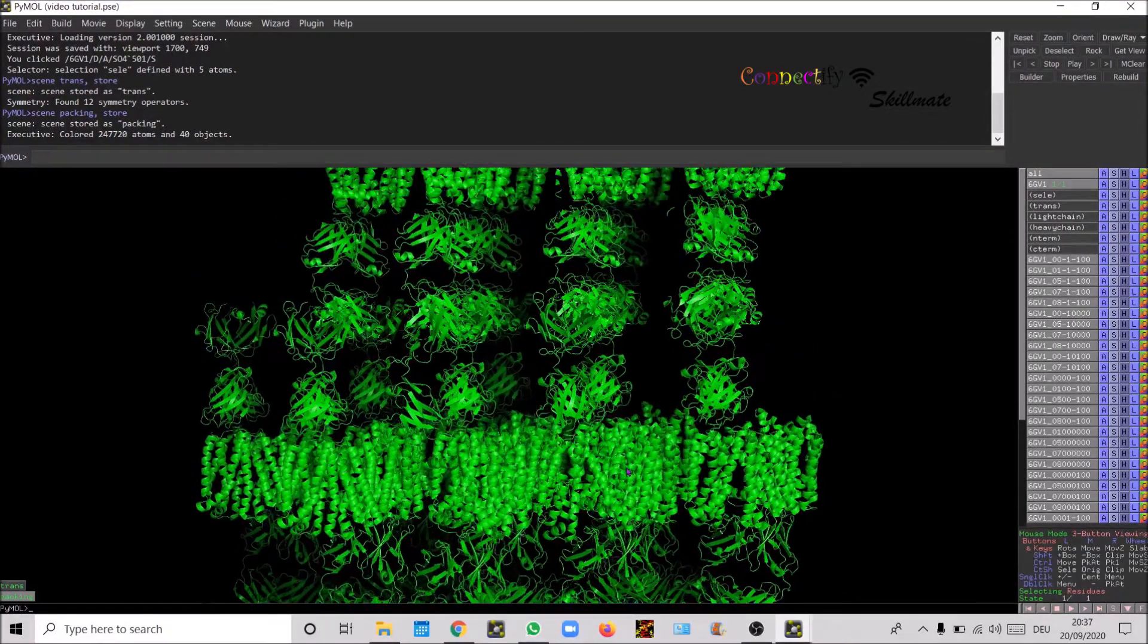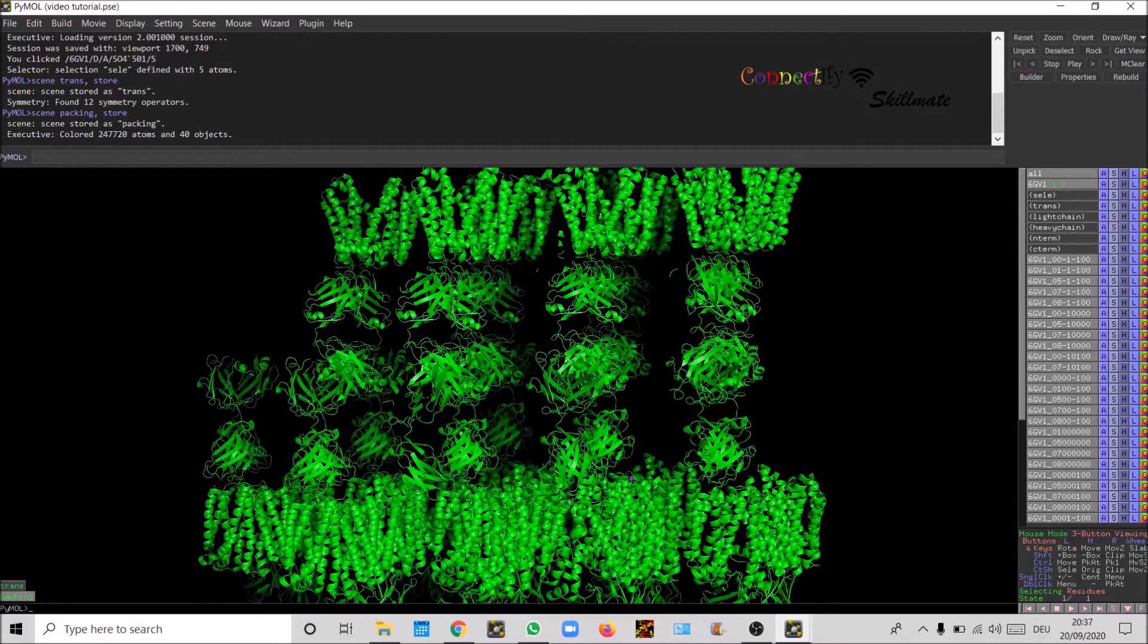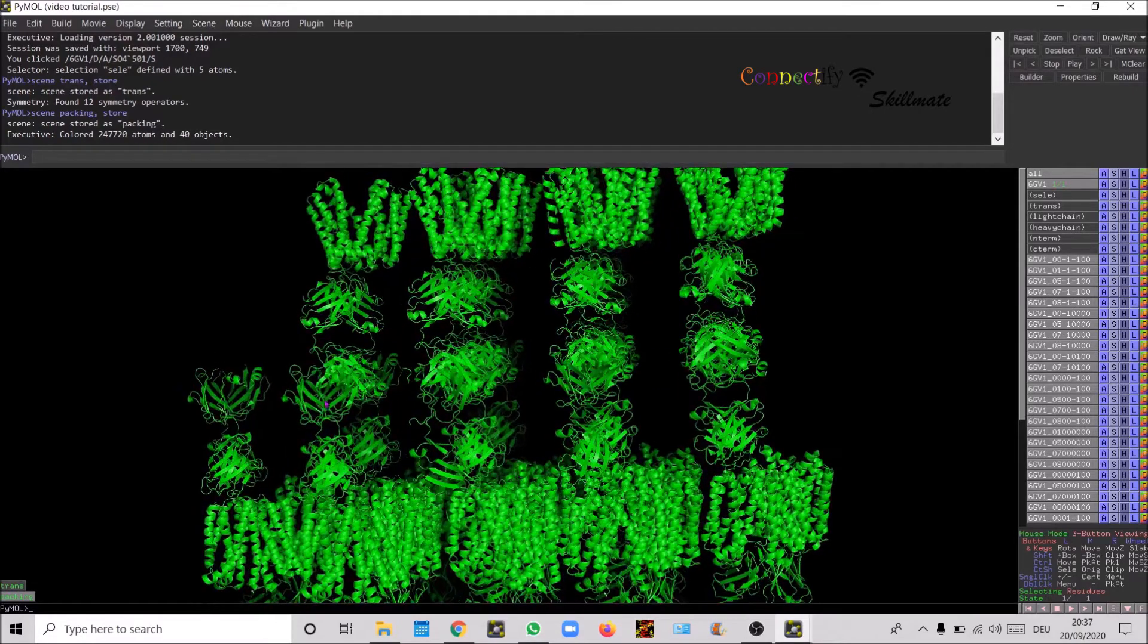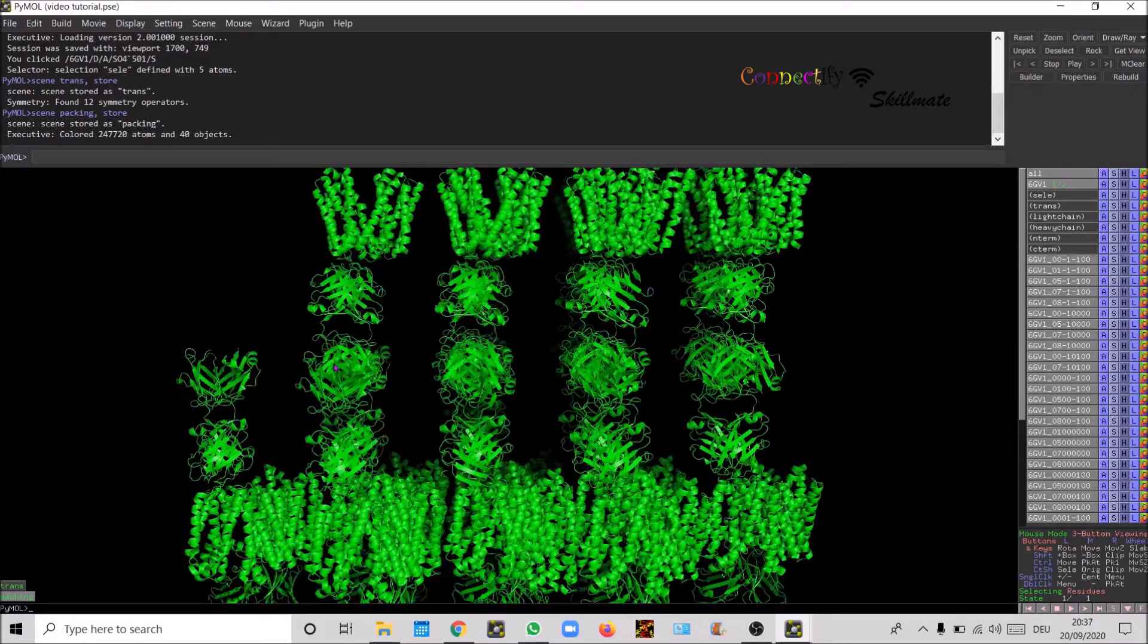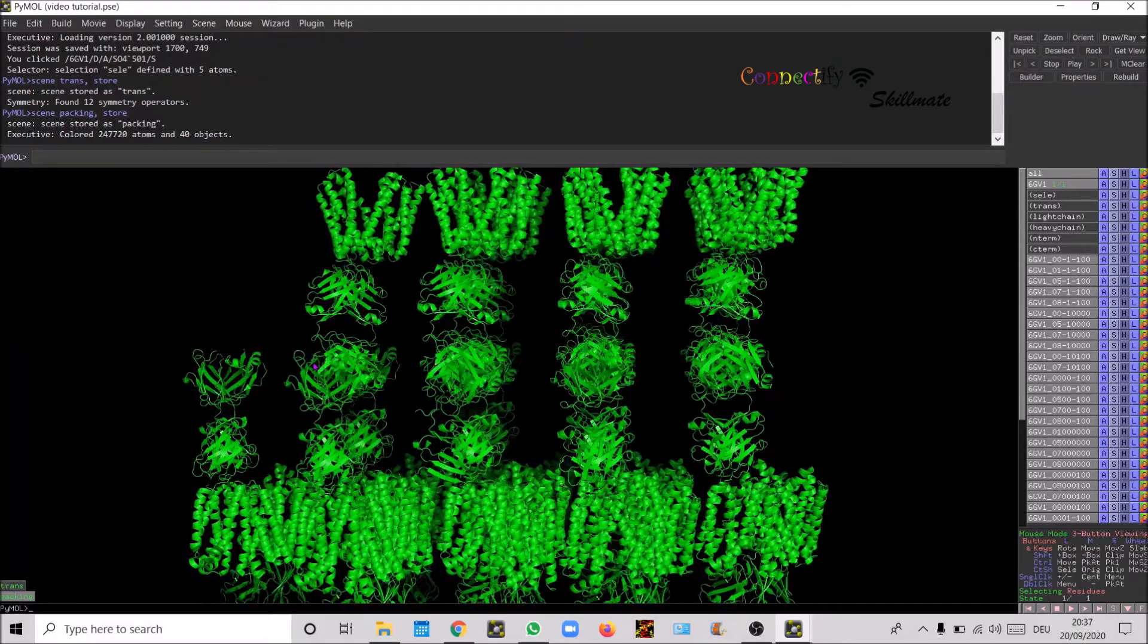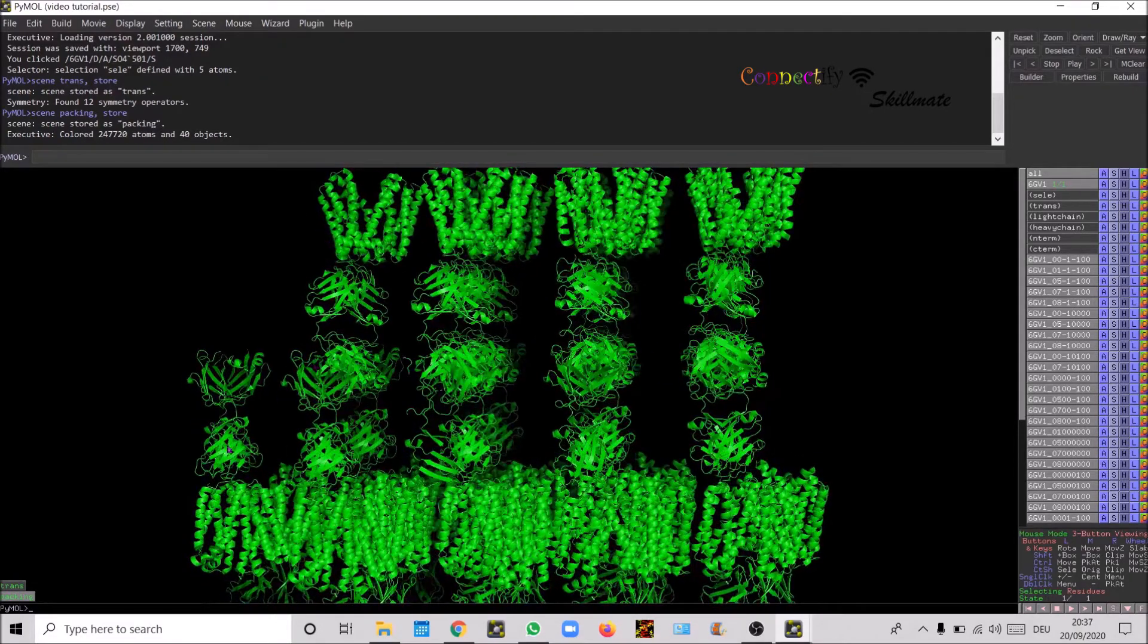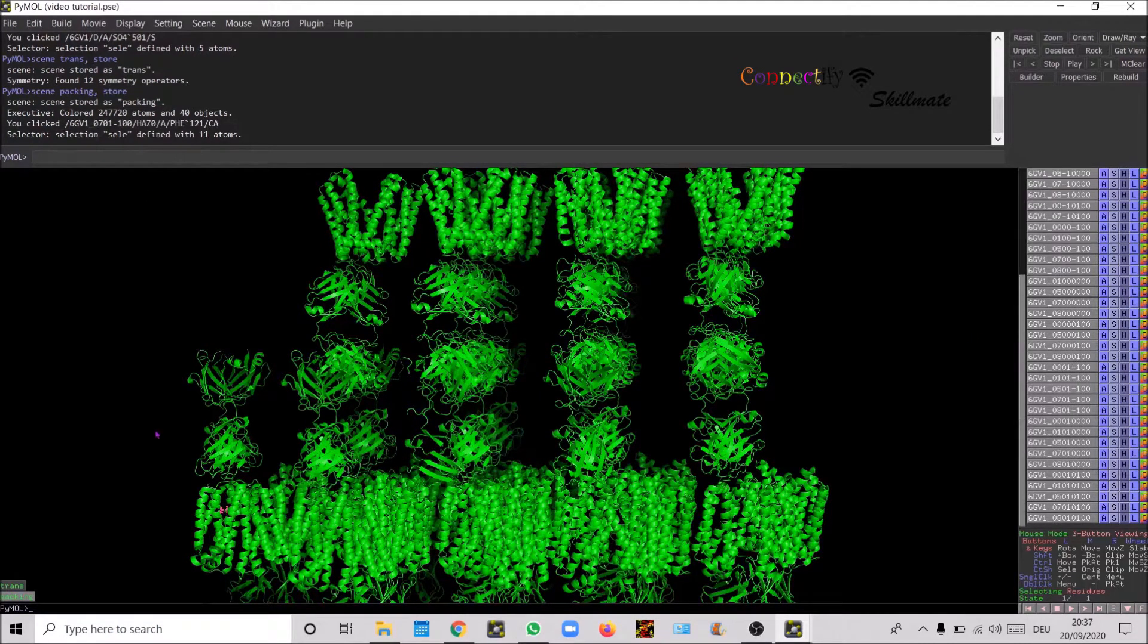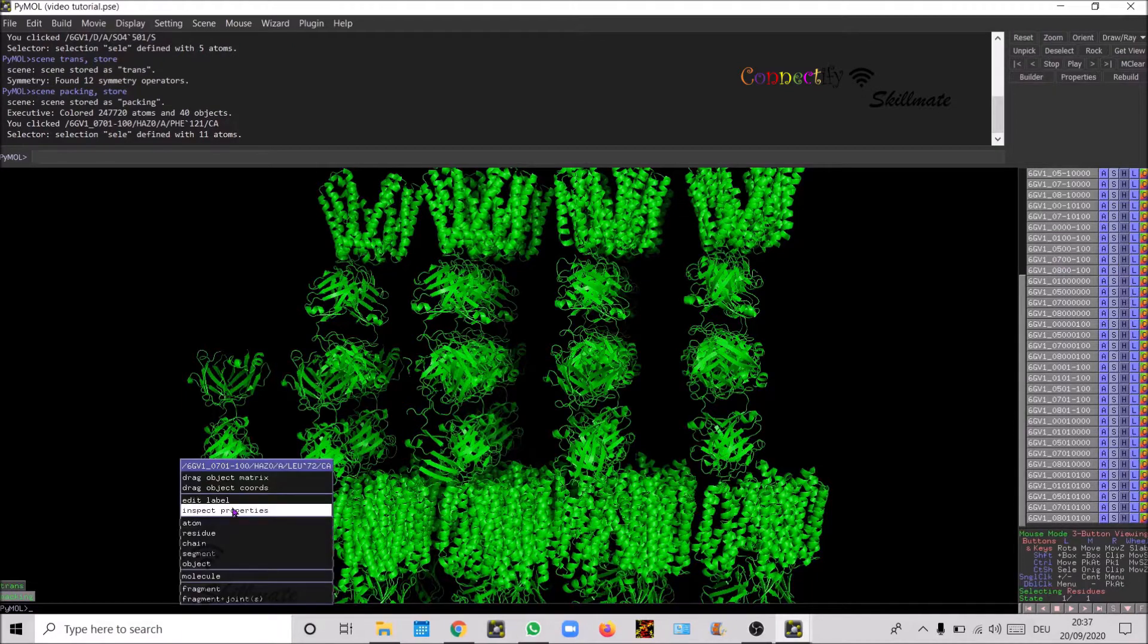Let's maybe set the packing. Going to zoom in a bit.